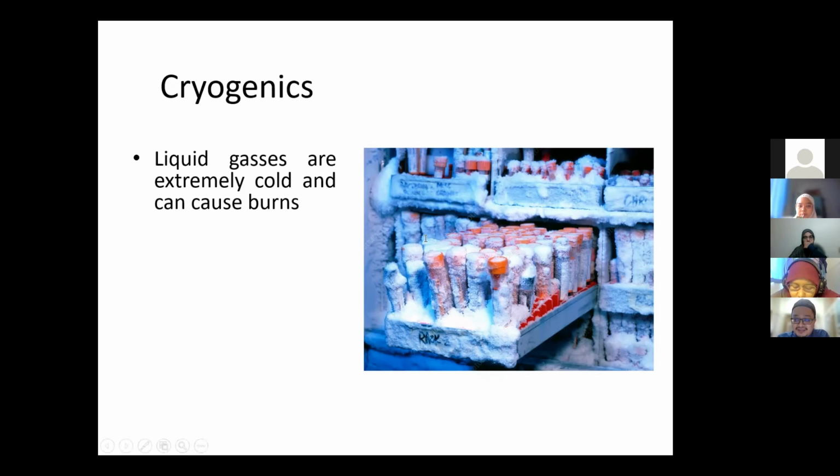So if I look at this picture, okay, ni menunjukkan kepada saya satu freezer yang tidak manage well. Itu je saya cakap. Sebab apa? Sebab freezer yang manage well, dia tak akan biarkan ice tu develop kat tepi-tepi ni contohnya. Ini contoh maknanya freezer ni pernah ditutup tak rapat.